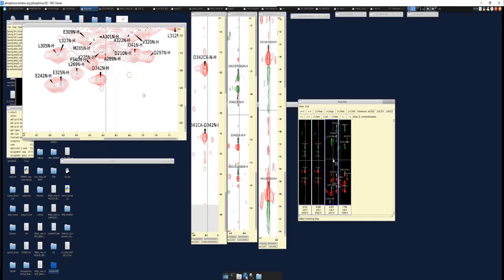And if we go down and actually look at these strips, right, what you'll notice is, let me zoom out a little bit so you can see, that this peak is matching with the I of this strip, when it should be matching with the I-1, right? And if we look at the C alpha here, there's probably a peak underneath here that's matching with it.